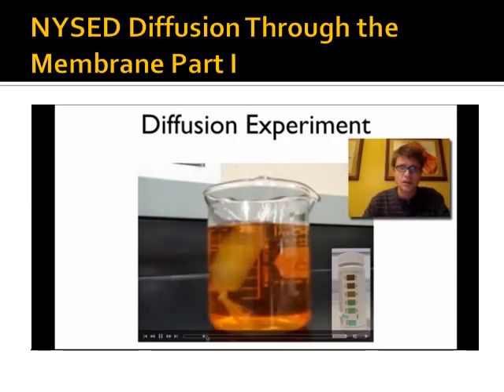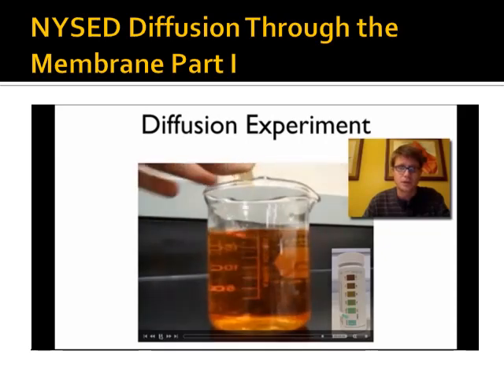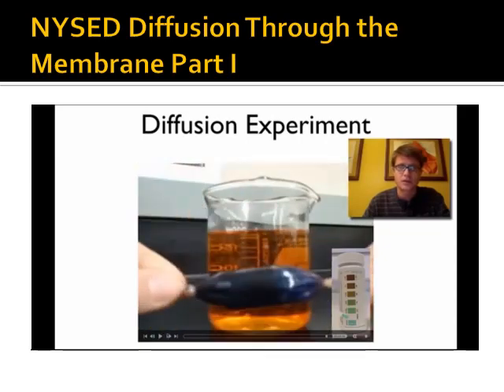And you can see immediately that it starts to get coloration change inside the beaker. And let me kind of move it up a little bit faster so we'll look all the way out here. And like play it there. So this is like 10 minutes later. And so now, 10 minutes later, when you pull it out, we've got the same dialysis bag.